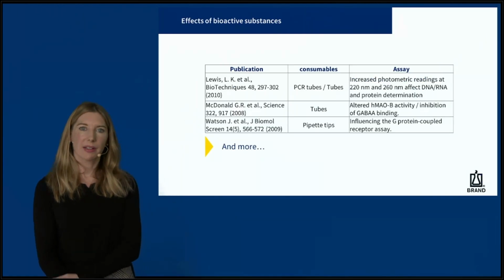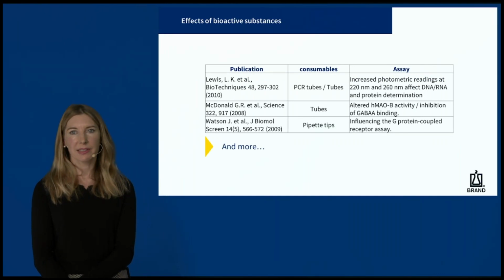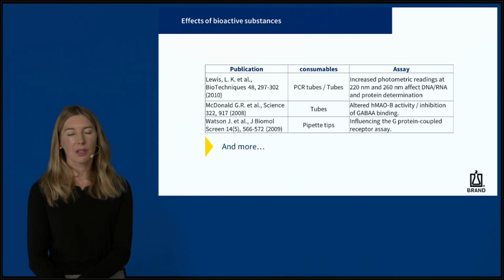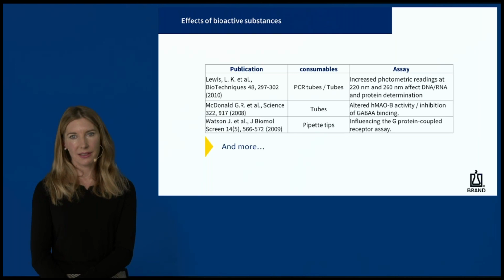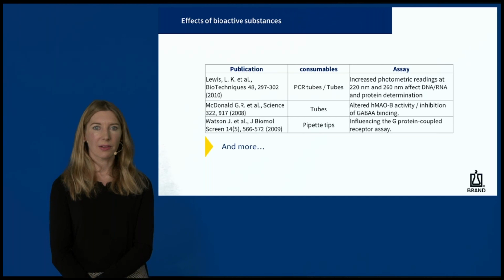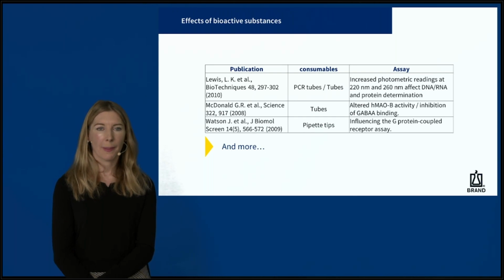Not every factor that can influence your experiment is obviously detected. For example, if you measure the DNA content of a sample and the spectrometer outputs a positive value, you probably assume that the measurement was successful and is correct. Already in 2008, scientists noticed that the use of different plastic consumables had an influence on the experimental results, and that this was due to substances contained in plastic consumables. This observation was published again several times in the following years for various applications.